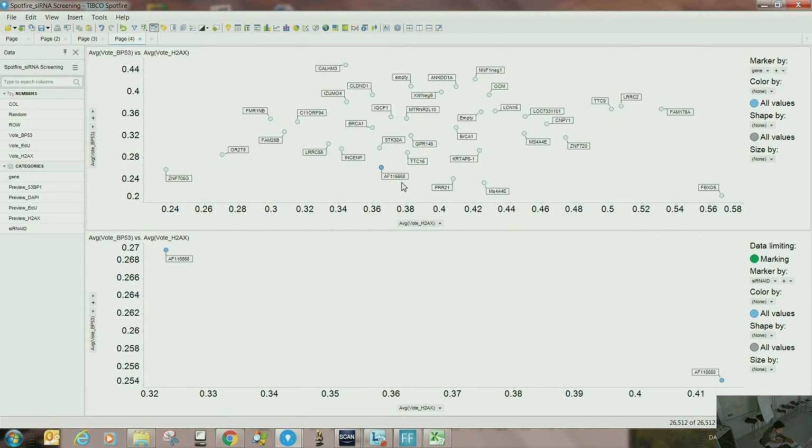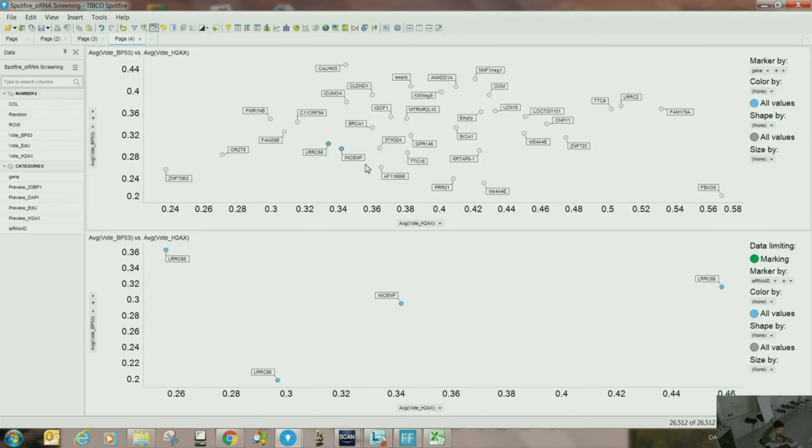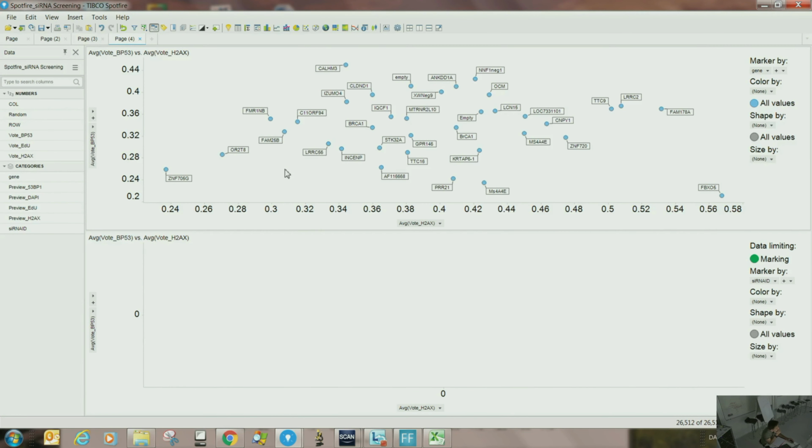Okay. Was the aggregation of the data, for example, for the things that you have 3 siRNAs? Yes. Did you do this in your analysis? Is it a MATLAB thing, or does it offer it already? Sorry, come again. You put together, let's say, the data from the two siRNAs. Yes. You did your analysis with MATLAB already? With MATLAB, yes. Okay. So this predates. Yeah, exactly. Because I have been given the labels to individual wells, right?